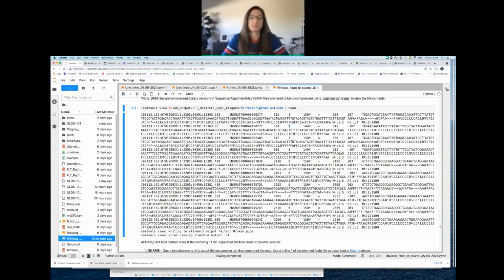also its read mate. And so for the next set of read pairs that we see mapping to 3 locations, at least looking at this view, how many locations is it actually mapping to? So for the next set of read pairs, so here and here, how many locations on the genome are those reads mapping to? Should be able to find it with that NH. Christina Zinrua is saying 1, so why do you guys think 1?